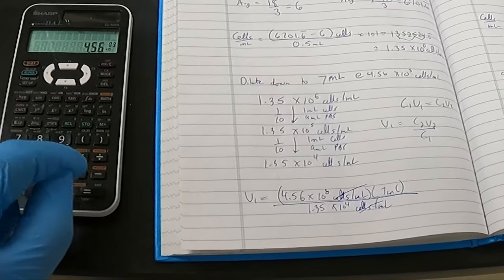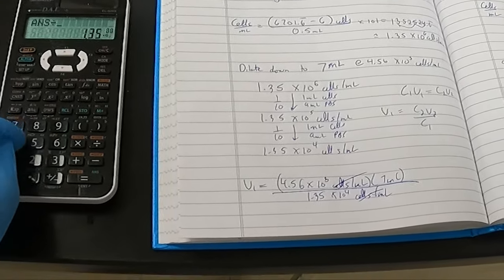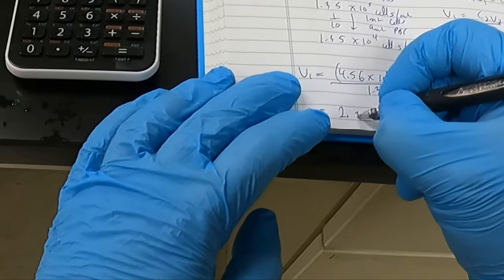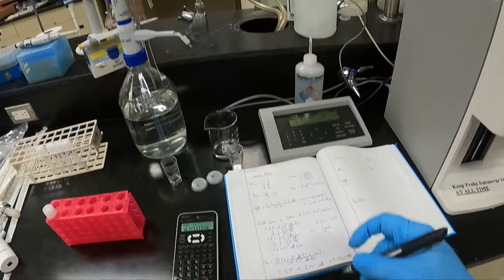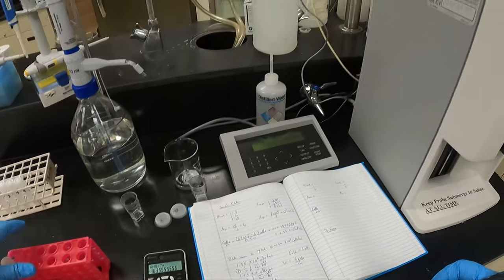Please include your units in any of your calculations. You can see cells per mil cancels out as it's on the top and the bottom, and milliliters is left. I've calculated 2.364 repeating is what I get. We'll round that off to 2.36 mils of cells. We subtract that away from 7 mils, and we have remaining 4.64 milliliters of my PBS. 1, 2, 3 dilutions is what I'll be doing here.